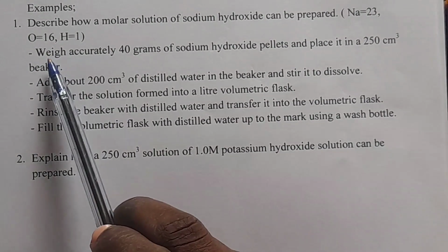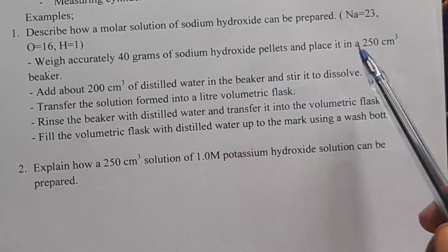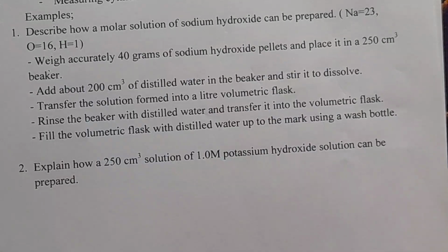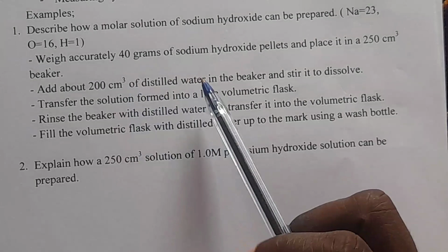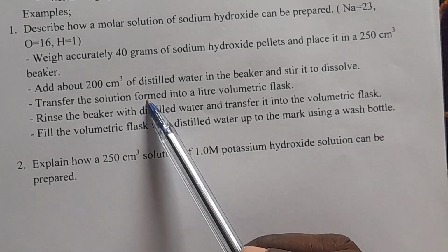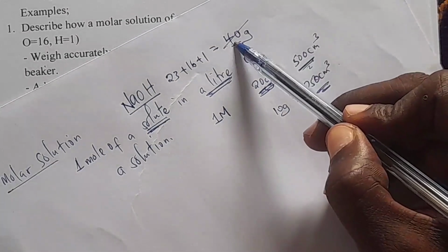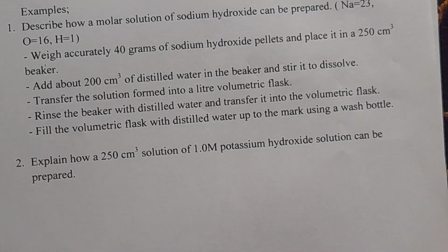To answer, weigh accurately 40 grams of sodium hydroxide pellets or flakes and place it into a 250 centimeter cube beaker. This is the beaker to put the solute. Then add about 200 centimeter cube of distilled water in the beaker and stir to dissolve. Transfer the solution formed into a liter volumetric flask, because here the mass of the solute that we have taken is 40 grams. So this 40 grams we are going to put in a liter. That means we are going to use a 1 liter volumetric flask.